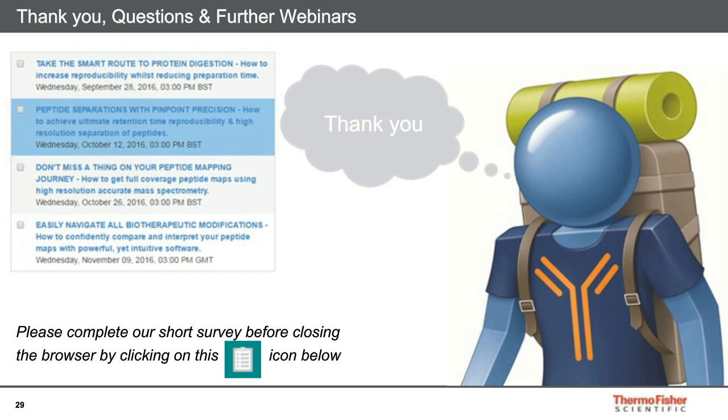You get rid of this pressure drop after the injection, and therefore you make sure that the flow is not affected by it, so the flow is consistent even during the injection. And the flow consistency eventually will affect the retention time precision, as we saw in the presentation. It's not the only thing that is affecting it.